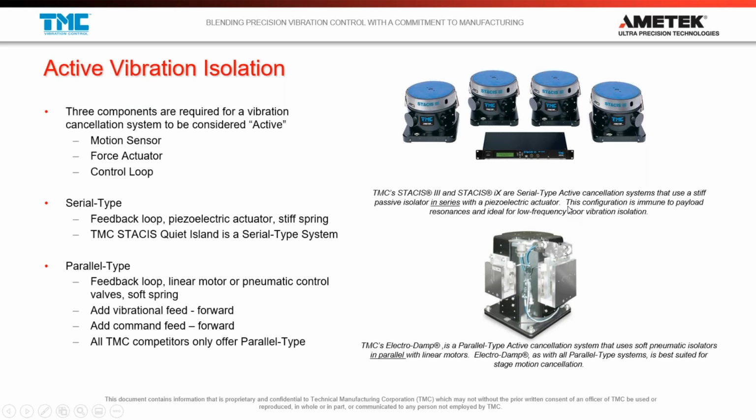And so an inherent characteristic of air isolators is this resonant frequency. And the resonant frequency at roughly 2 hertz is going to be something that could be very problematic, especially as you get into more and more sensitive instrumentation. And as you try to get things to higher resolution, higher magnification, an air isolator with its resonant frequency might not provide enough floor vibration isolation. So now we start talking about active vibration cancellation systems.